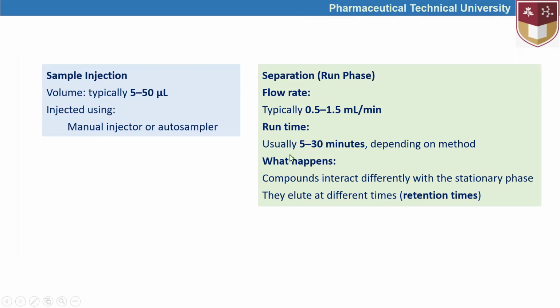And the runtime is between 5 to 30 minutes based on the retention time of the studied compound. If the compound is identified in the early minutes, like 5 to 15 minutes, and if we witness the absence of other compounds in the remaining 10 minutes starting from 20 minutes, it can be possible to stop at 20 minutes, or 5 to 20 minutes could be selected for further analysis.